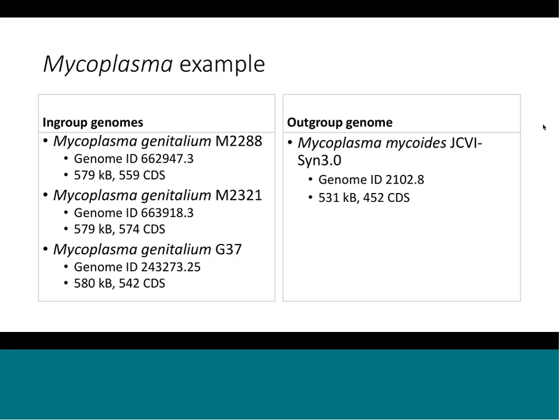There's one other thing I just wanted to mention because this comes up every single time I give a workshop. You notice that I have the names for the genomes, and then right underneath it, it says Genome ID with a specific number. Believe it or not, to the biologists out there listening, Genome ID is a very important number. Let me give you an example. Right now, we have 15 Mycobacterium tuberculosis H37Rv genomes in PATRIC. So that name is not specific. Why do we have that many genomes with that name?